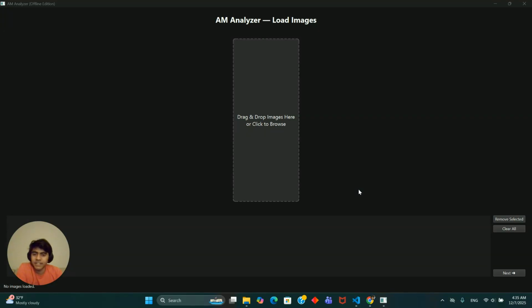Hey, I'm Aryan, and I've developed a tool that helps analyze microscope images of additively manufactured samples. And in this video, I'm going to demo it to you.